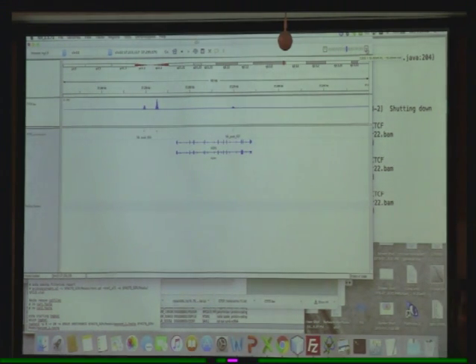It's included in the program. So which one are you loading here? This is HG19. Can you guys see in the top corner here, make sure this says human HG19. That's the annotation that we used. And okay, so I loaded this data, the bigwig, everyone do that. Now we only have chromosome 22 in here. So just go into here and go to chromosome 22, and that'll zoom in to that chromosome.